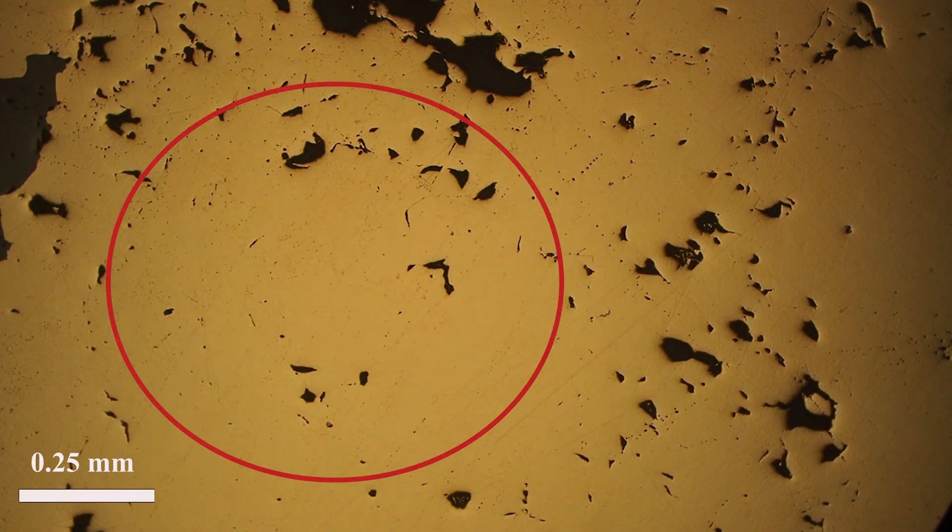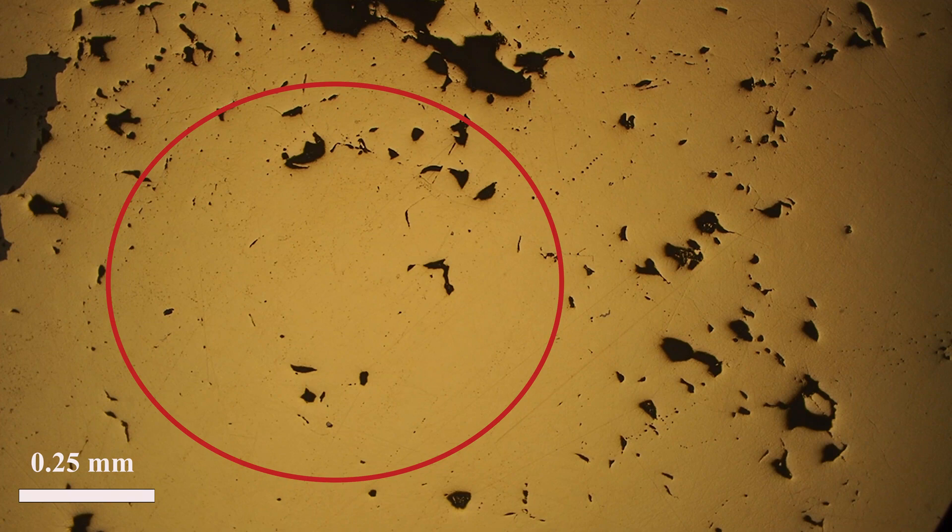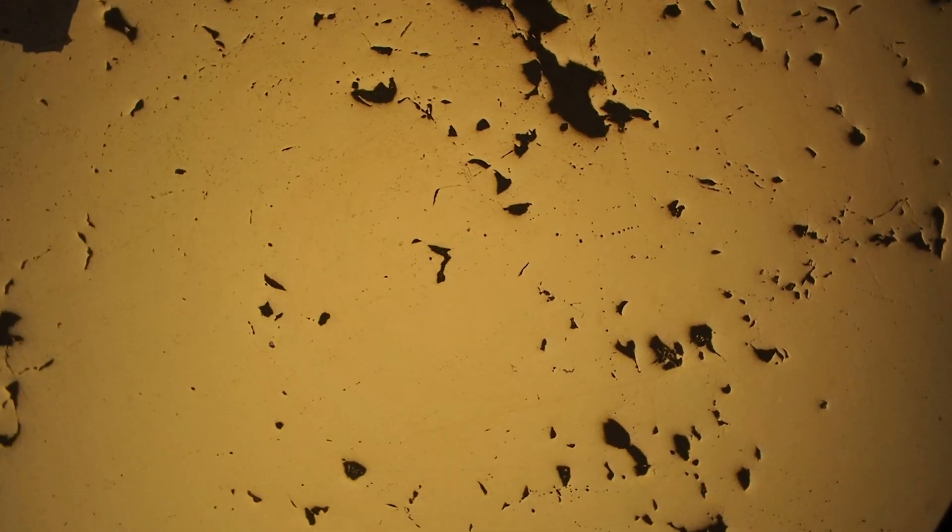All right, now we're going to switch to another chalcopyrite sample. Again we see this rich yellow color. It's very soft.